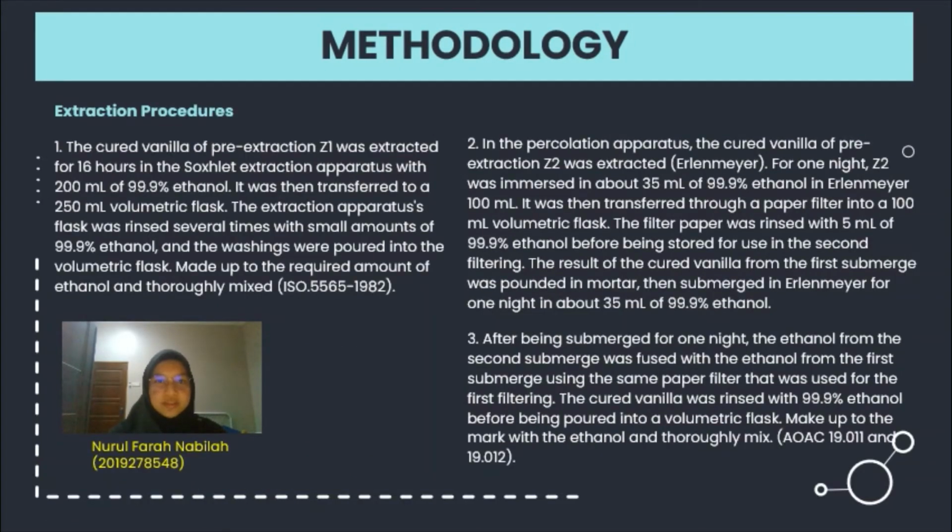Extraction procedures. The cured vanilla of pre-extraction Z1 was extracted for 16 hours in the Soxhlet extraction apparatus with 200 ml of 99.9% ethanol. Then it was transferred to a 250 ml volumetric flask.